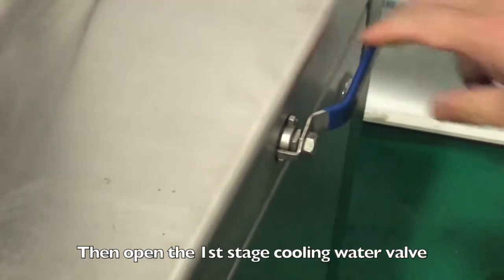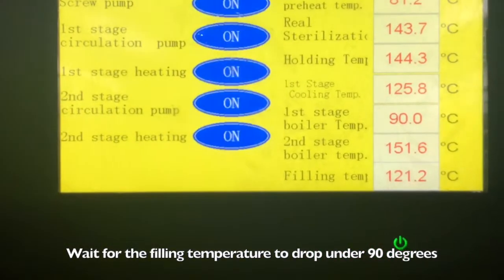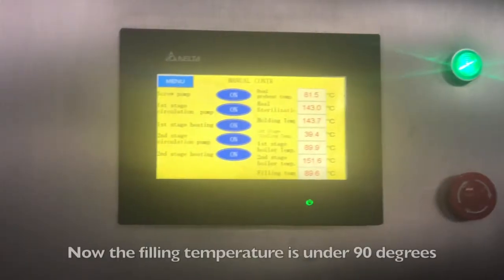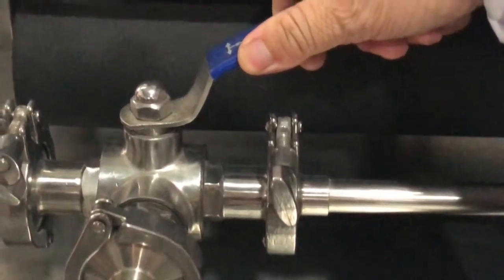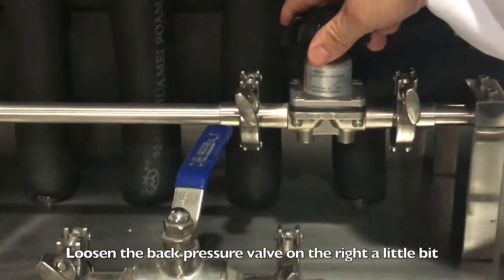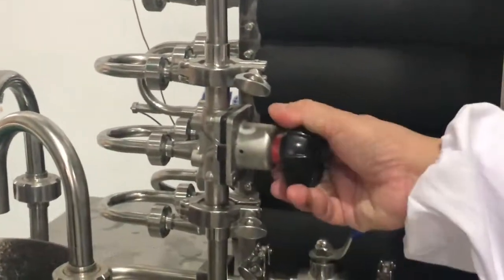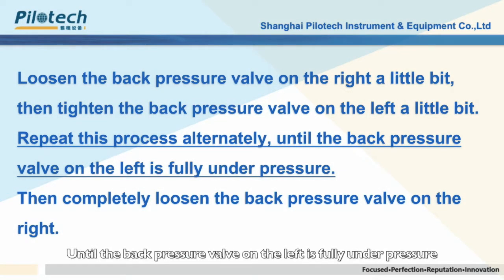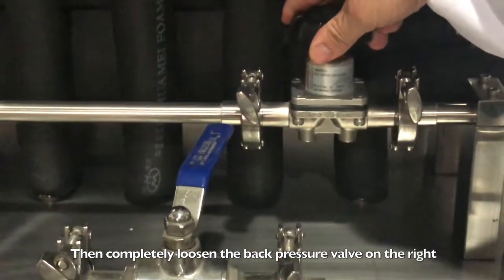Then open the first stage cooling water valve. Wait for the filling temperature to drop below 90 degrees. Once below 90 degrees, turn the 3-way valve to the drain position. Loosen the back pressure valve on the right a little bit, then tighten the back pressure valve on the left a little bit. Repeat this process alternately until the left valve is fully under pressure, then completely loosen the back pressure valve on the right.